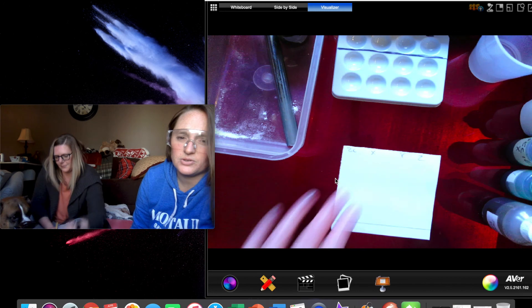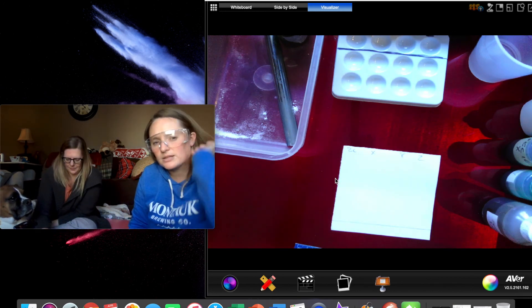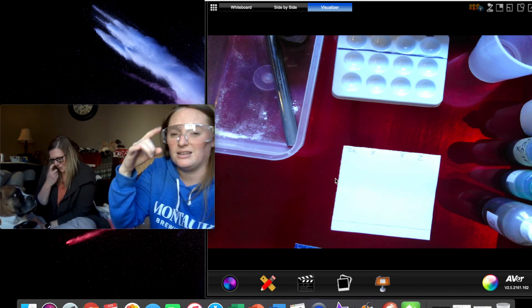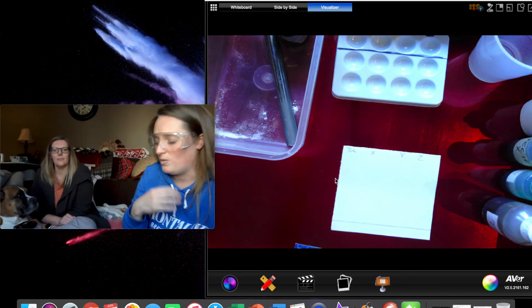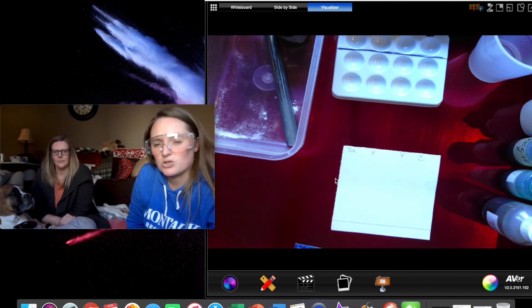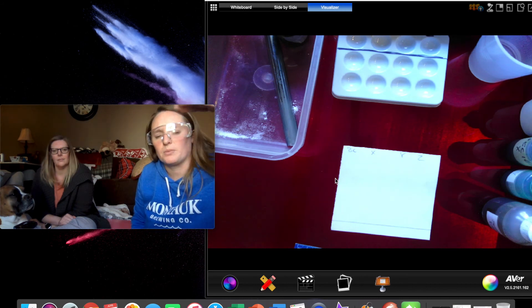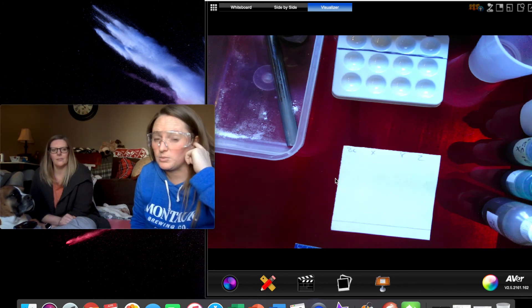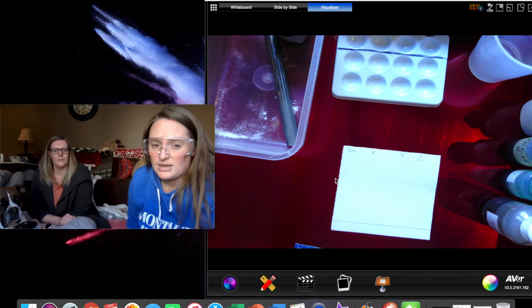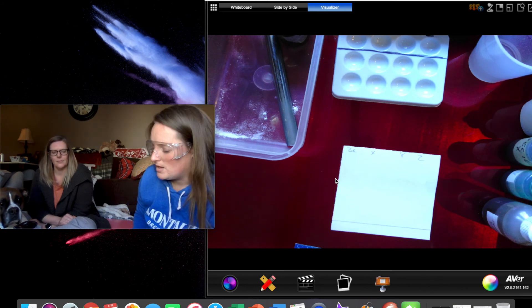We're doing paper chromatography here. If we were to use pen it wouldn't work well, because we're going to take pigments from these plants and put them into water — and water would dissolve the pen ink. What we're looking at is the solubility of the plant particles. The water spreads up the paper carrying the colors with it, so we use pencil to avoid the pen pigment also spreading.